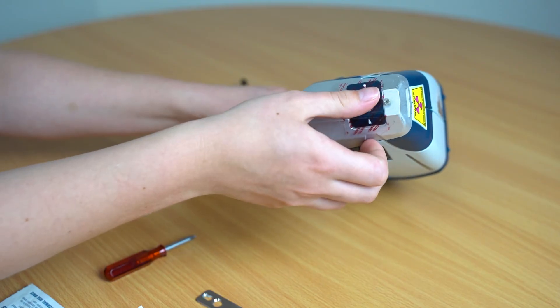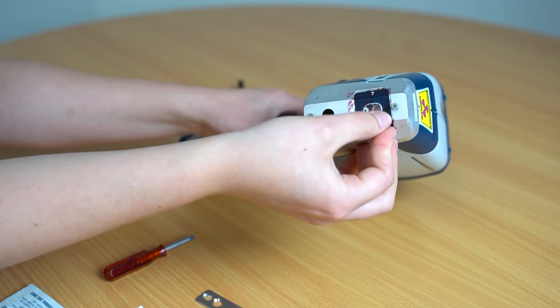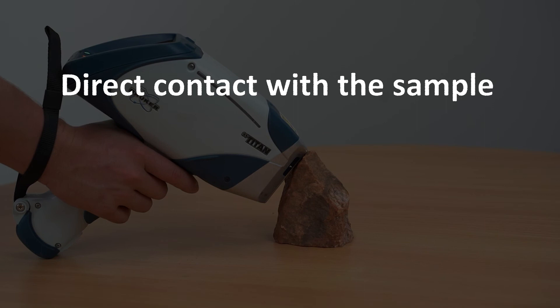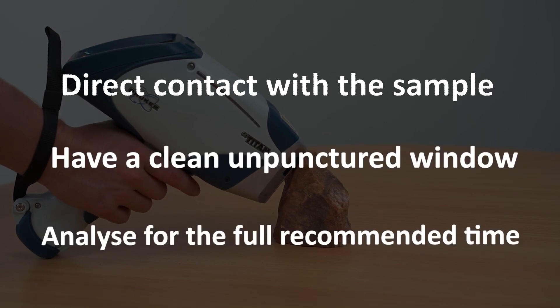If the window is accidentally pierced you would need to replace it immediately before the next scan to ensure your results are consistent and the instrument remains clean inside. The key things for taking good analysis are: having direct contact with the sample, having a clean unpierced window on the instrument, and analysing for the full recommended time.